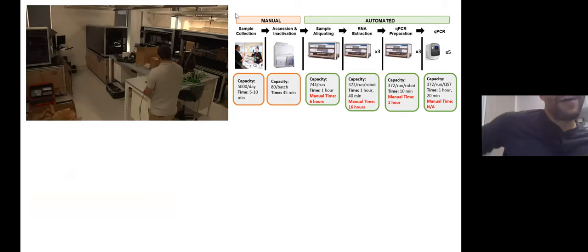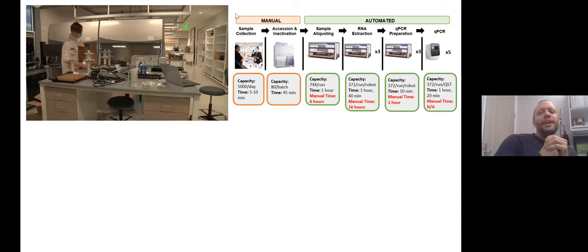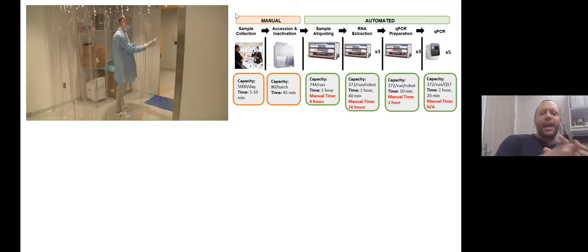But all jokes aside, this is really an interesting time, because what it's really doing is helping the public understand the need for us to do high-throughput reproducible biology quickly and effectively and how that can affect the whole world. And so the labs have gotten up to speed, and you can see in the upper right, again, we're doing RT-qPCR.